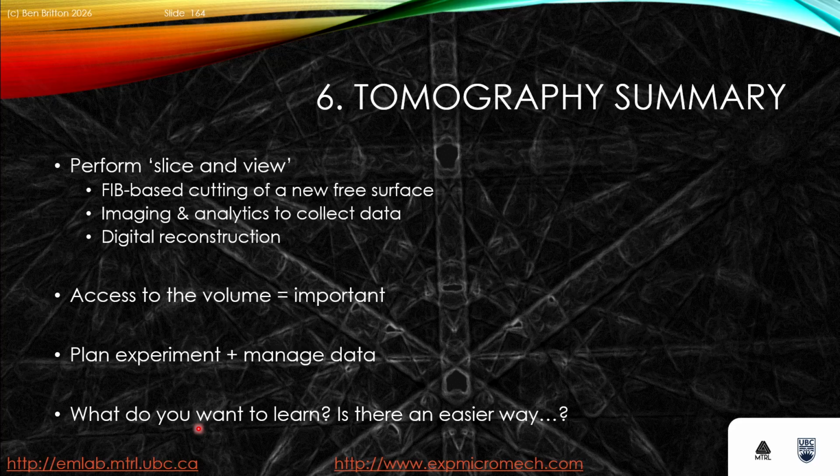So hopefully at this point I've persuaded you that tomography can be very valuable if set up well. It can be quite expensive in duration, but basically we perform slice and view based approaches, and we are going to use FIB-based cutting to produce a new free surface. And we're going to use imaging and analytics to collect the data and subsequent digital reconstruction. We need to be able to access the volume, so we typically do this, being careful about how we trench, put it on the edge of a sample, or do a full lift out.